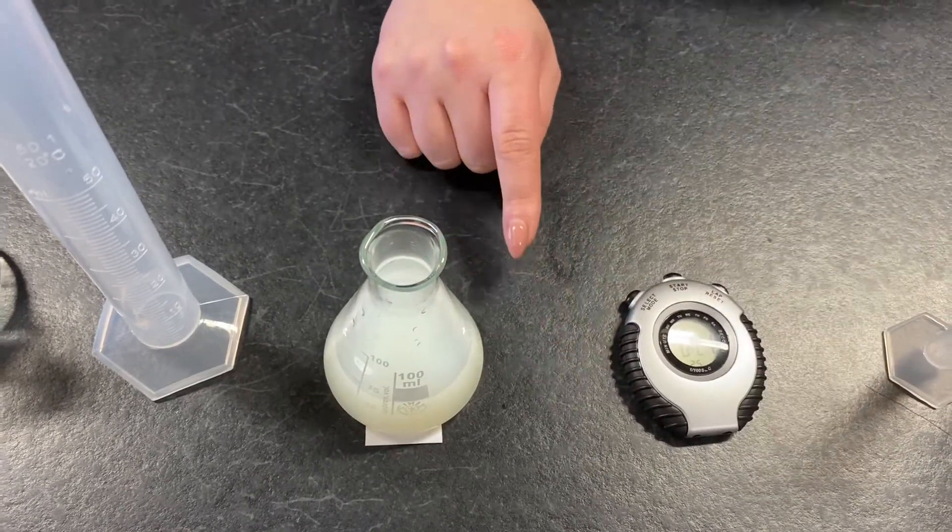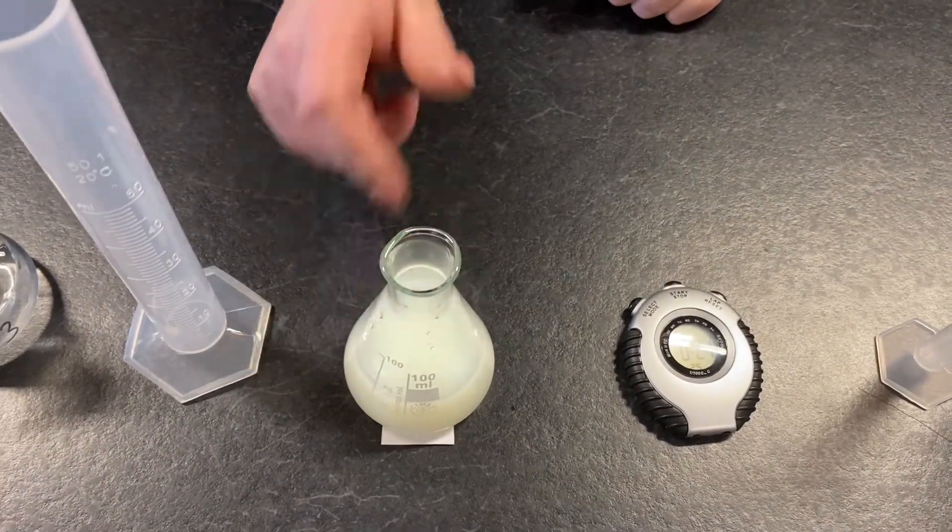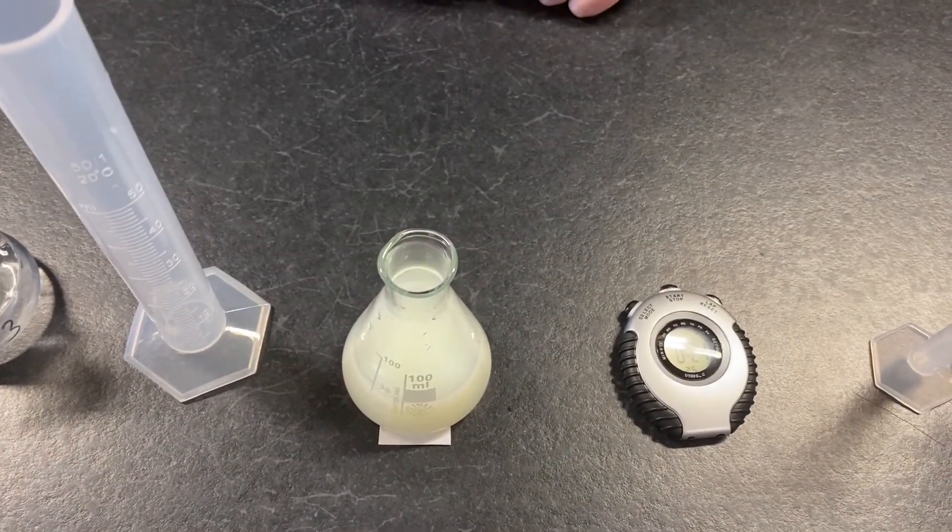We're going to repeat this experiment three times with each concentration and then we're going to work out an average.